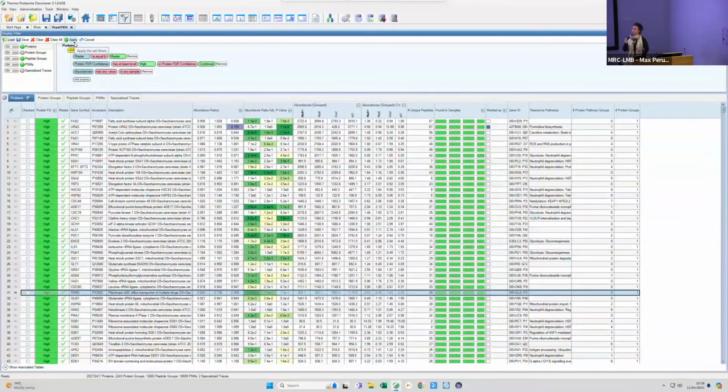Yeah. I mean, it's not so much for reproducibility. It can take a while until you put in all the filters that you want. So you kind of want to start already from a baseline, right? You can build on that. So what we provide is usually the basic filters. And then you can build depending on the questions that you want to ask your data. For instance, in some situations, you might not want to filter out proteins that came only from one unique identification, from one unique peptide, for some specific reason, because actually your protein of interest is really low in abundance. You just want to see if it's still there.